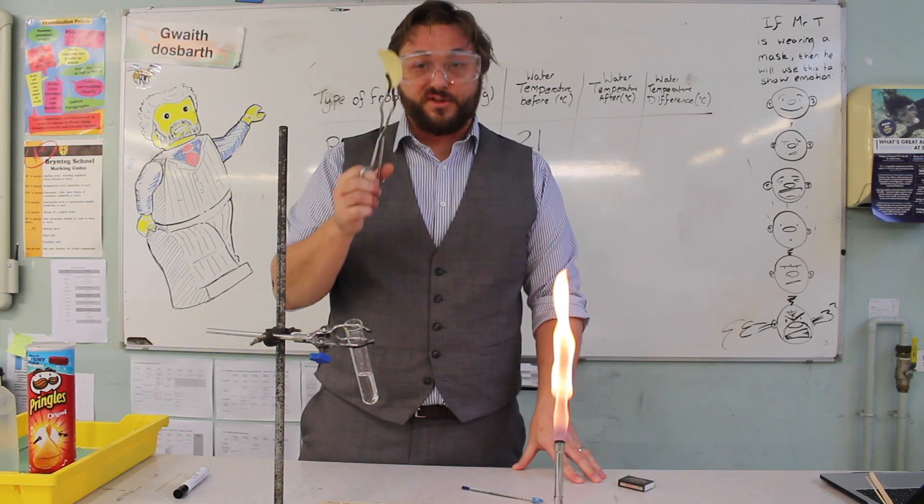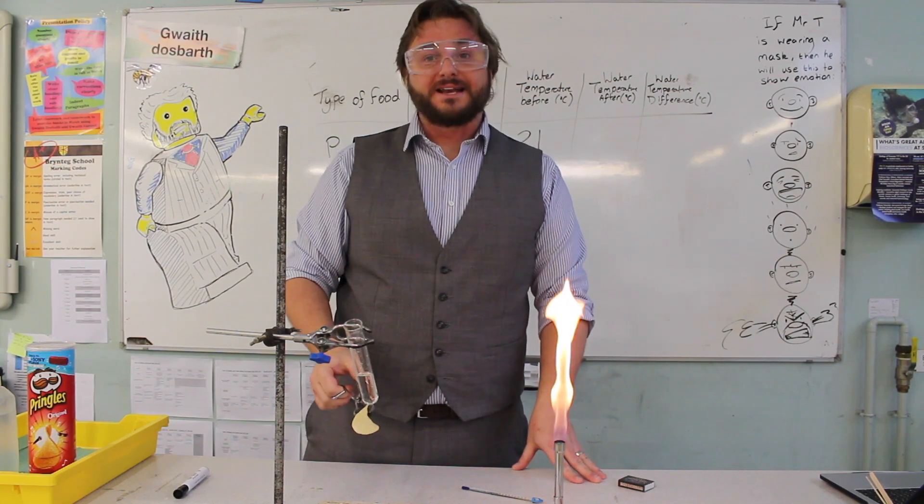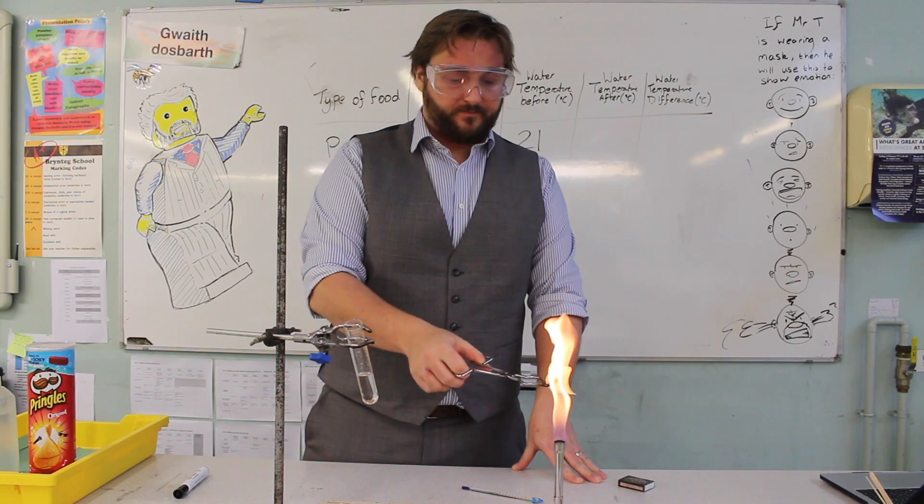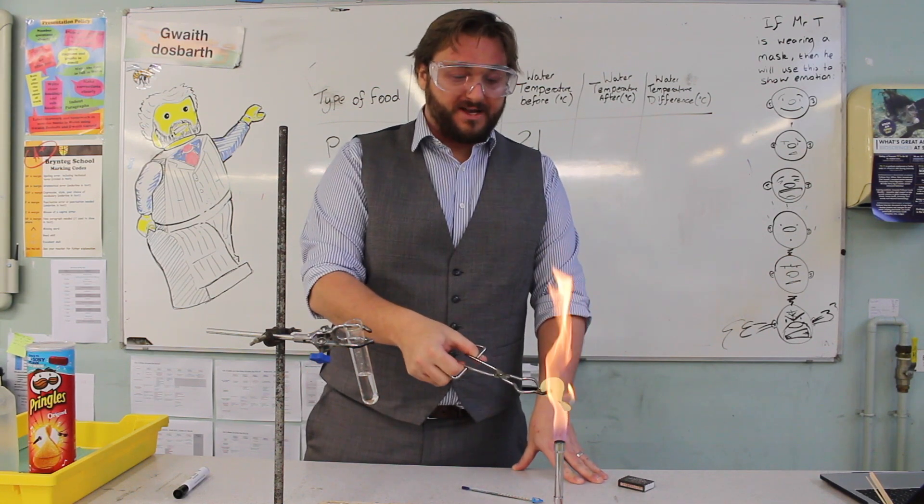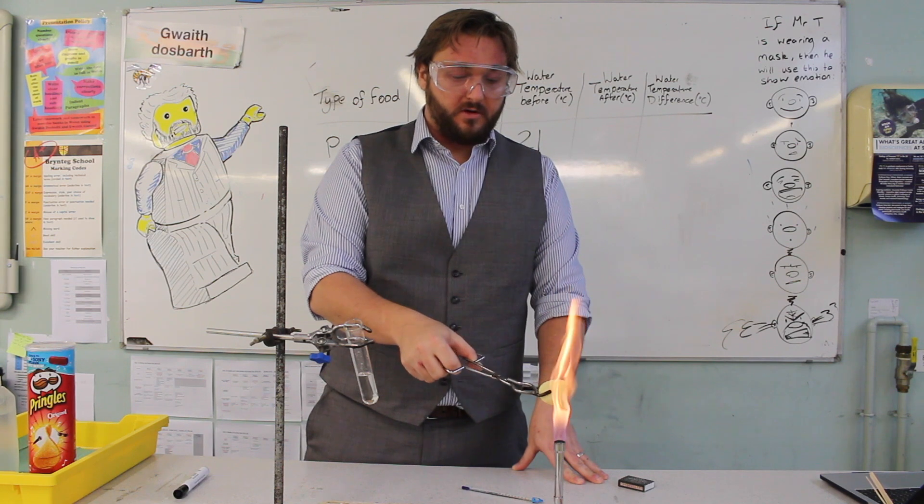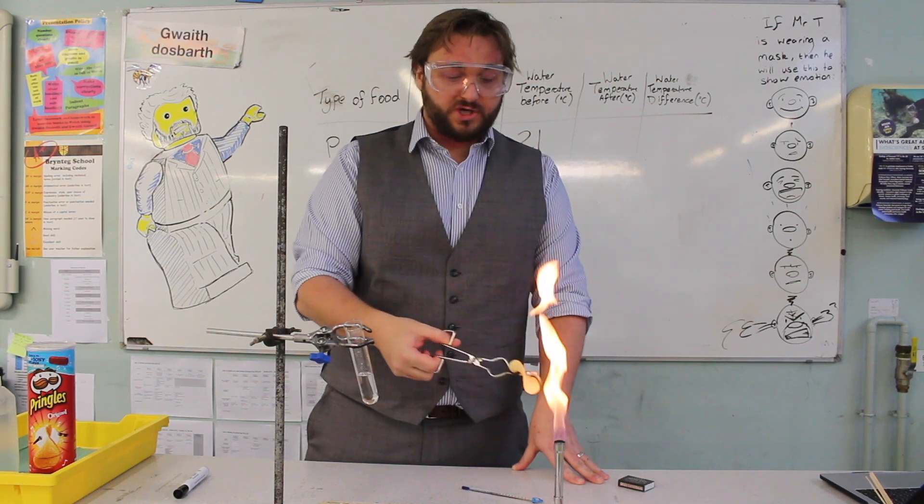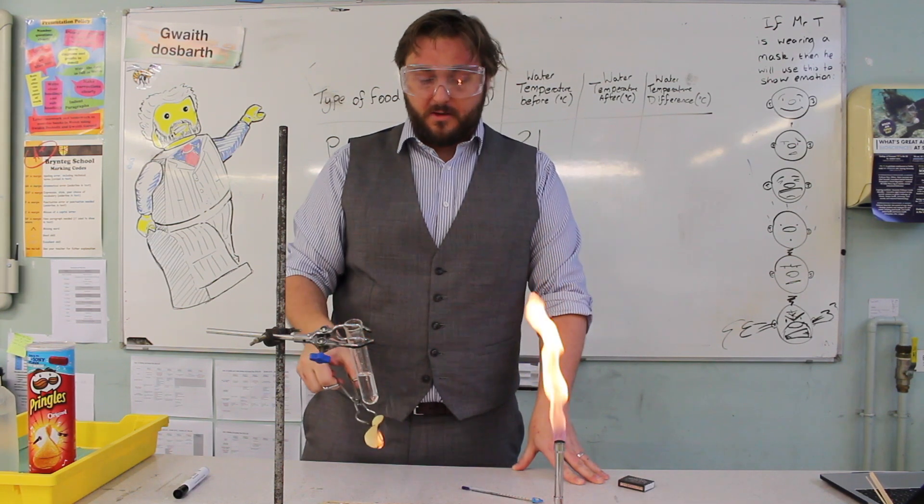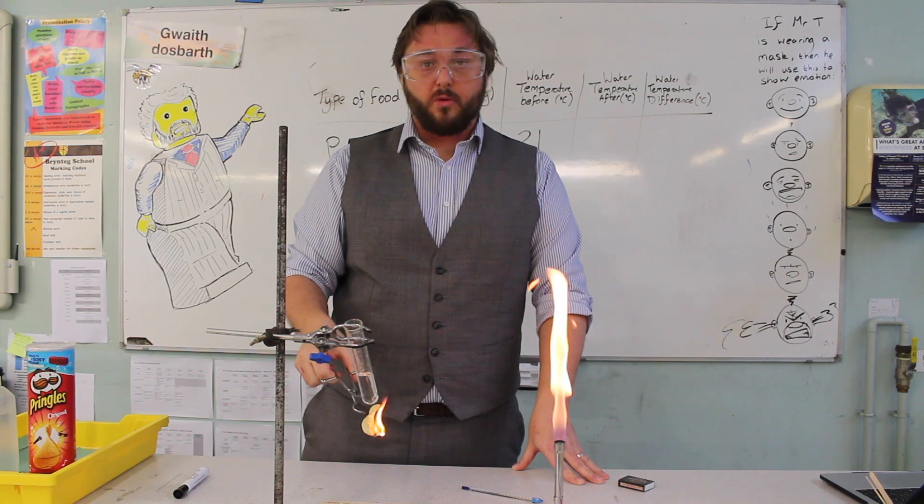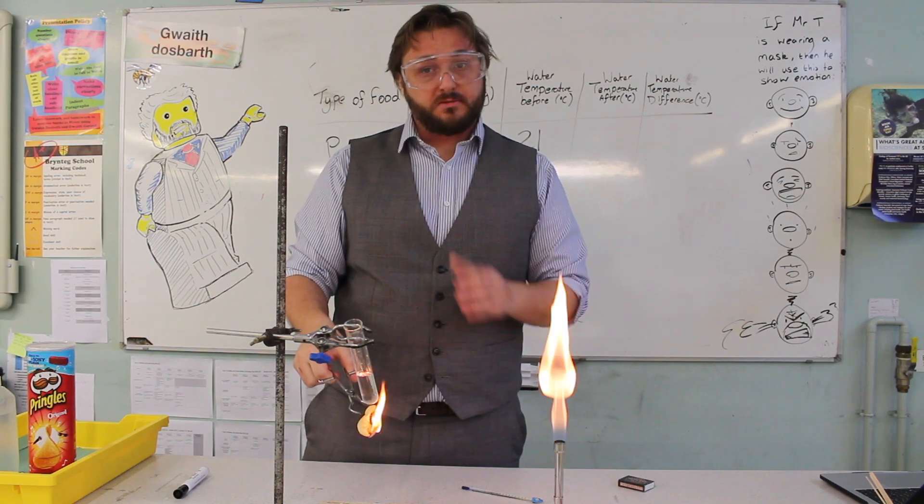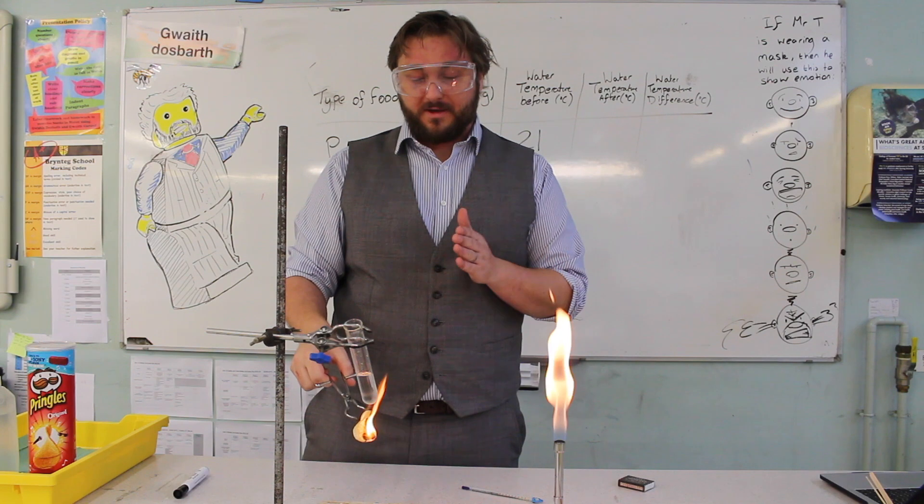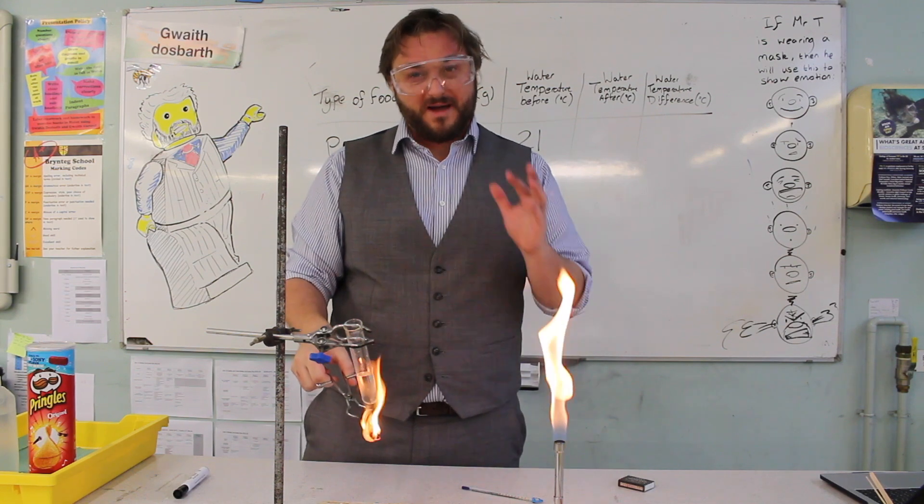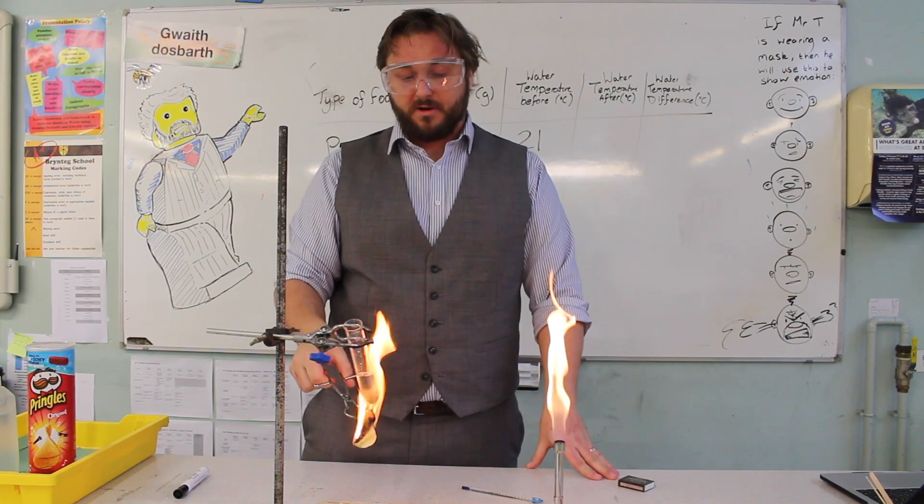We're going to light our crisp on fire. As soon as it's on fire, we're going to place it underneath our water. So hold the crisp in the mouth of the burner until it starts to catch flame. If you take it out too early, it will just be charred. But once it's on fire, put it underneath your boiling tube. You don't want to move it around or wave it around, keep it in approximately the same place about I would say two centimeters below the boiling tube.